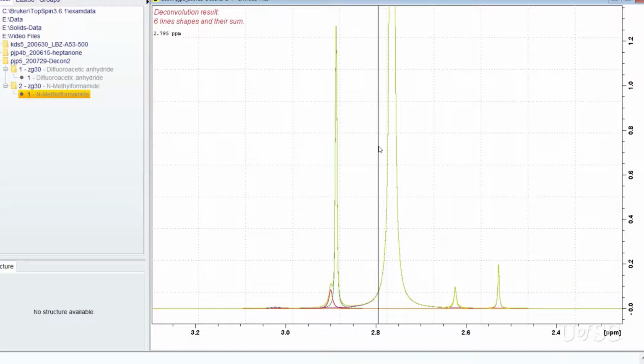Notice it does not have any of the ugly truncation that the multi-display mode shows. We assume that these results are used for the numeric values and the truncation is just a graphic artifact. However, we cannot be sure, so we advise people to include the outer unwanted lines in all calculations.